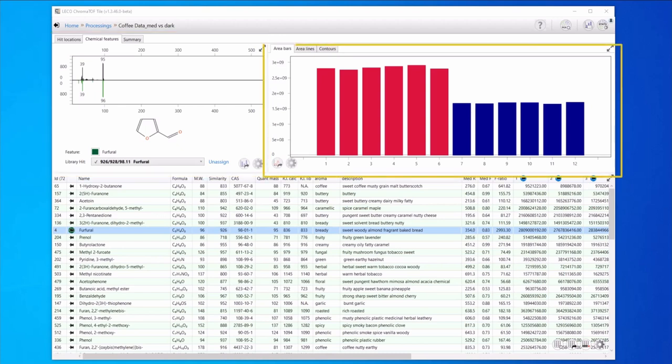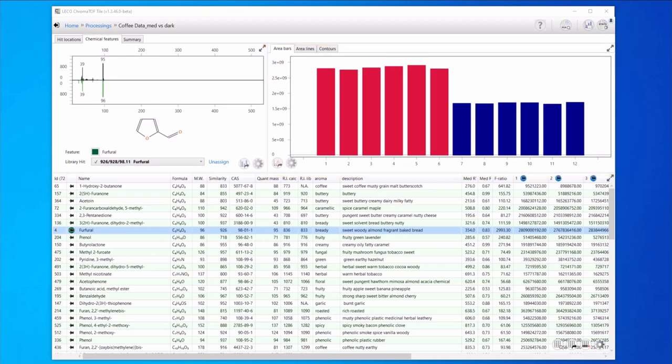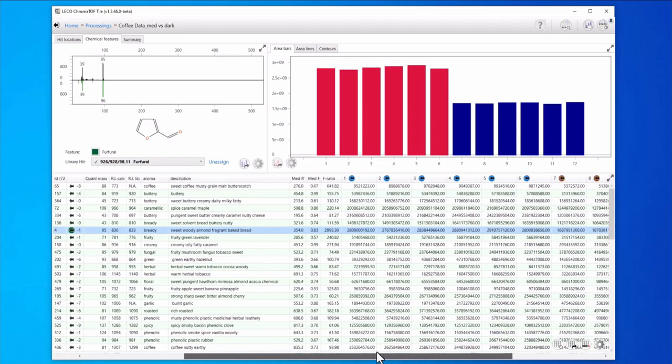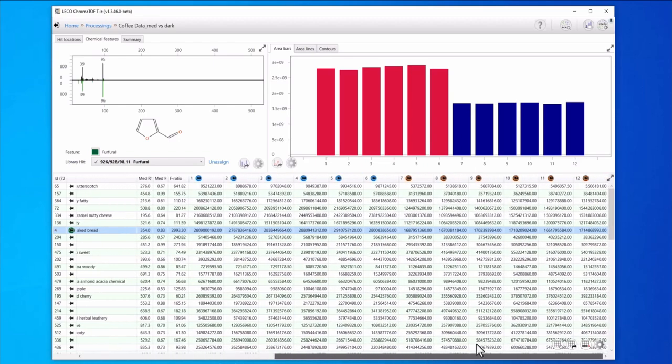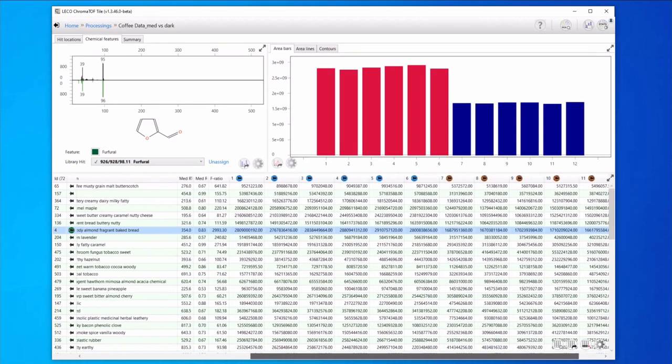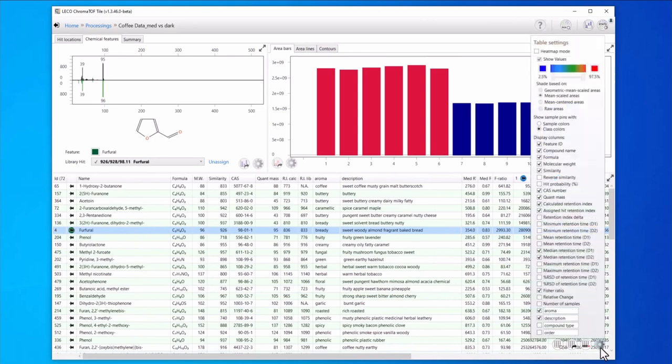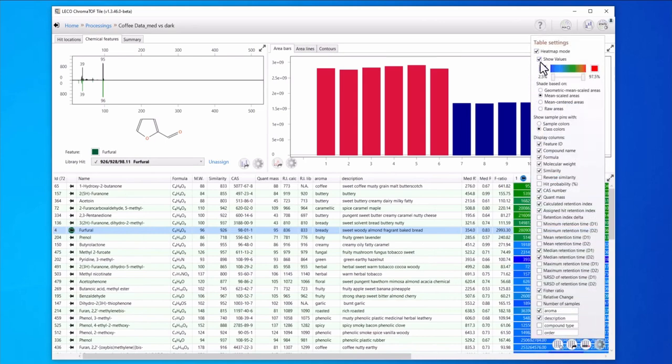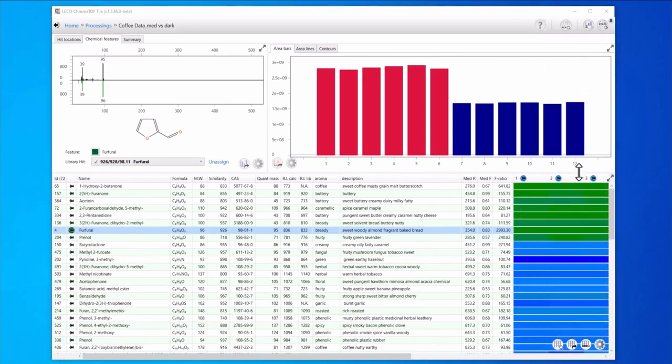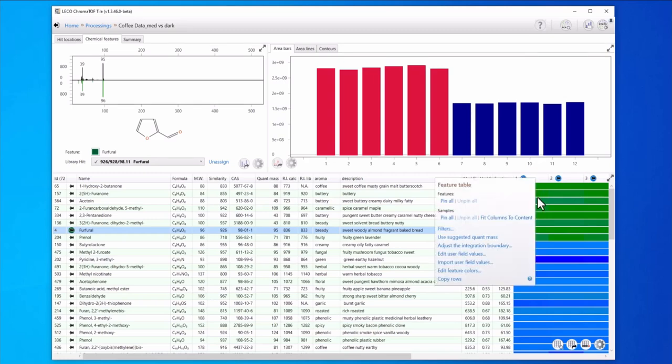The relative trends across the sample set are shown in the bar chart. Here the first six bars are the medium roast samples and the next six are the dark roast samples. We also have the intensity information for all 12 samples tabulated in these columns at the back of the table. These can be displayed with their values or as a heat map which is another nice way to visualize the trends.